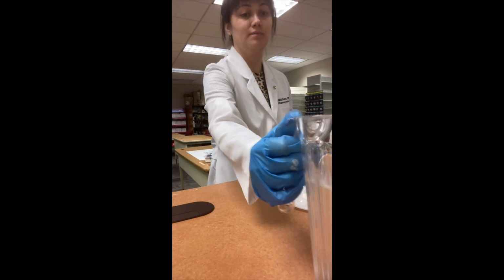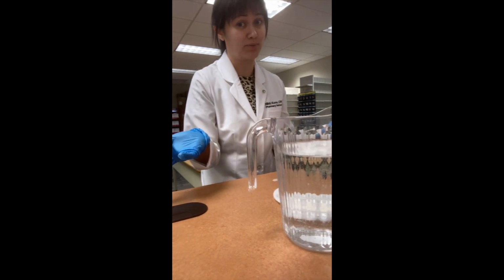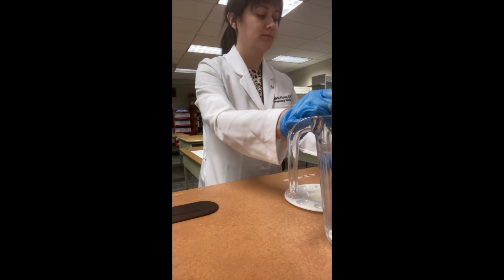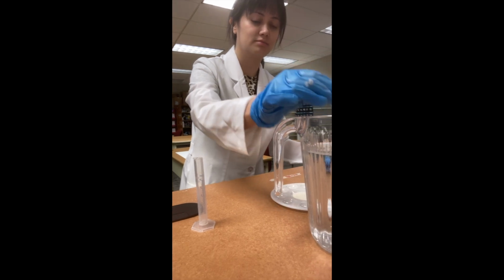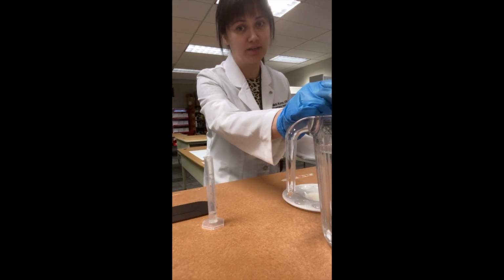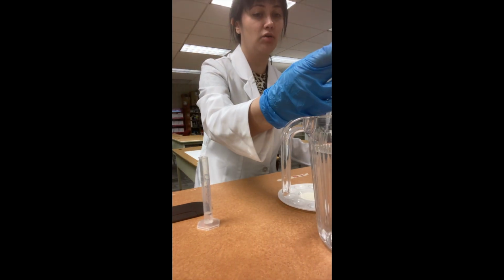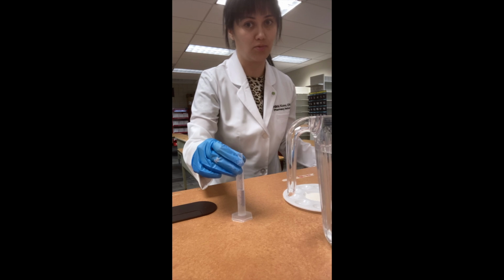Now, just because it's going to be difficult to pour this into a graduated cylinder, just like that, and because we can practice our pipetting skills, we're going to take a pipette and we're going to fill it up. Each of these pipettes are 3 milliliters, and we want to get 6 milliliters in the graduated cylinder, so we're going to go about 2 times in order to have enough. So you use the pipette by squeezing the top, it draws the liquid in, and you can see here that the top of the pipette has a line. So these pipettes go up to 3 milliliters. For this, you always want to measure at the bottom of the meniscus, which is the curve of the water.